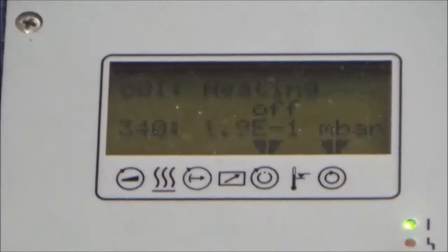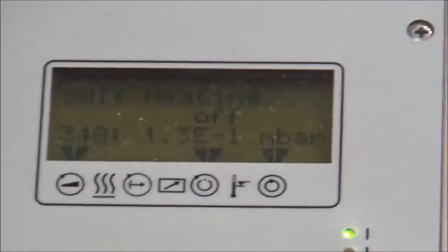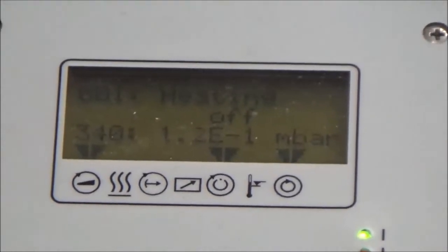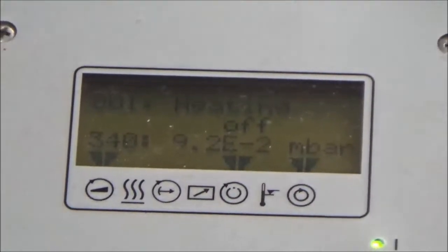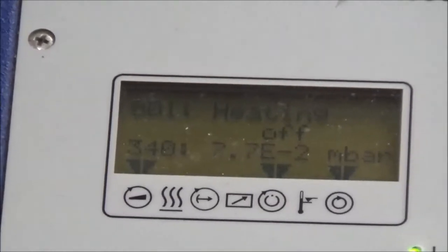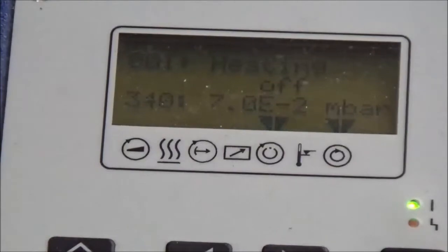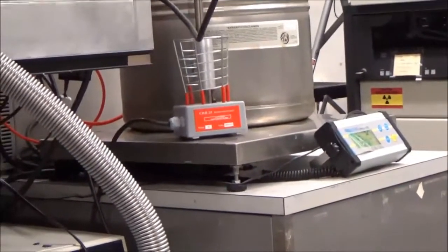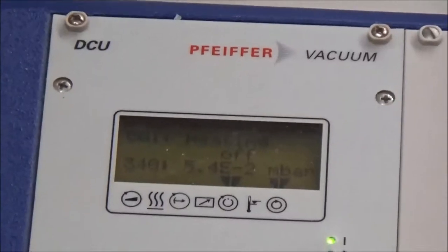You can see the vacuum jumped up. And the pressure's going down, but not tremendously quickly. Again, it's got to pump down quite a bit of head space. And also remember the transfer line is in here heating up, which means it's giving off water, which is also changing the pressure reading here. But anyway, now we're basically just going to let this thing sit for 24 hours.